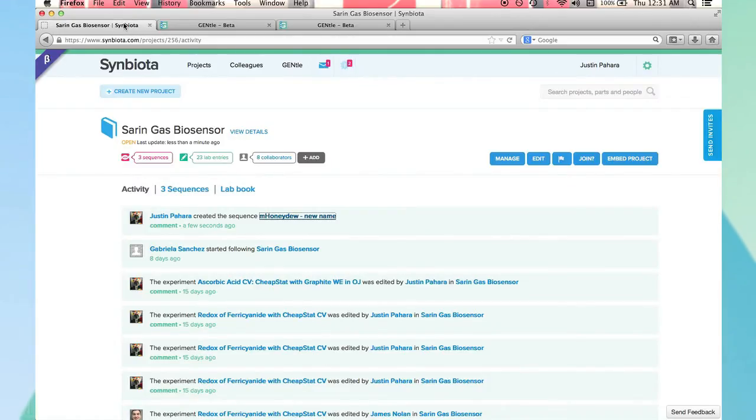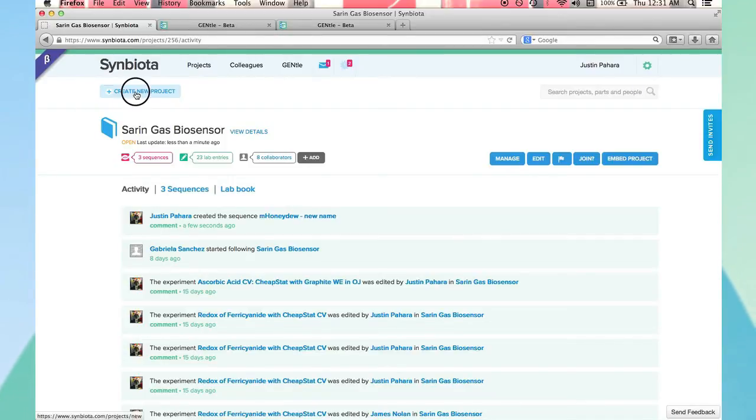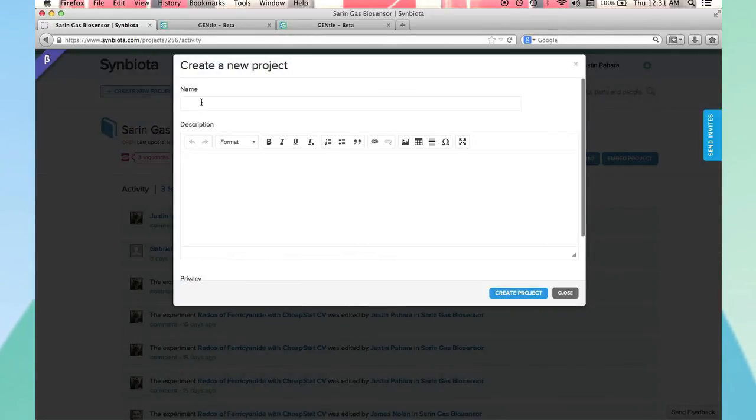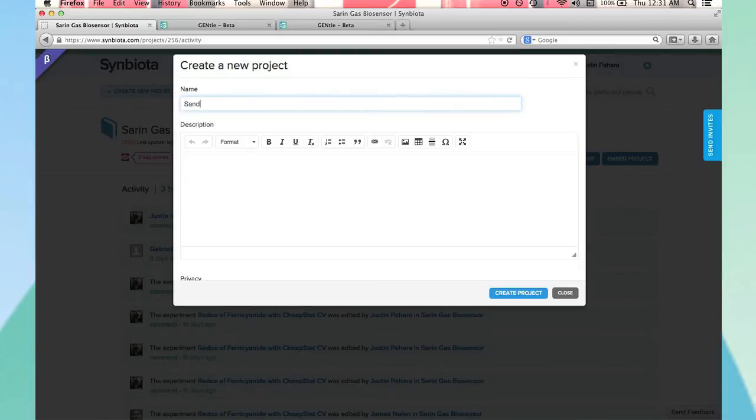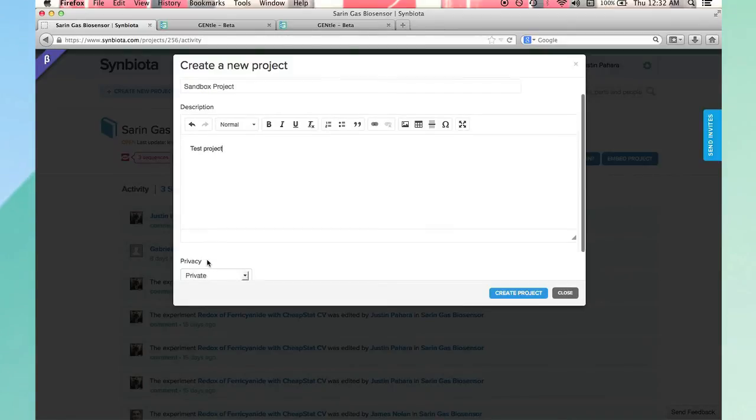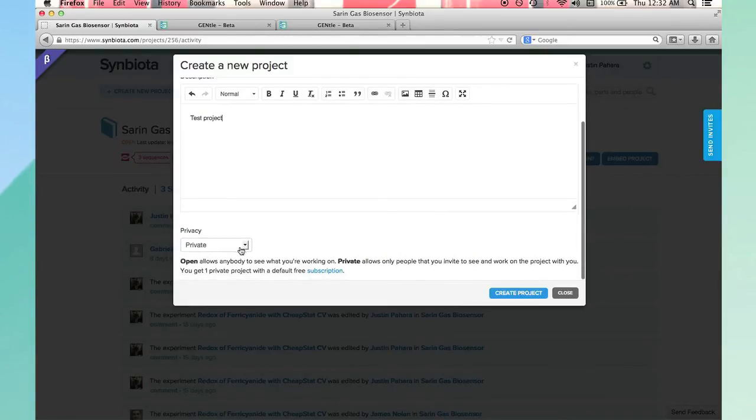Now that you've seen an active project populated with real data, let's create a project that you can get going. Add a title and a description. Choose whether you want this project to be private or open access.